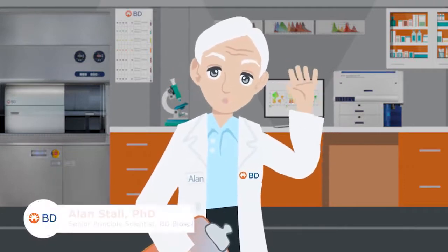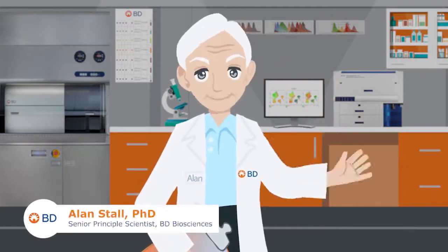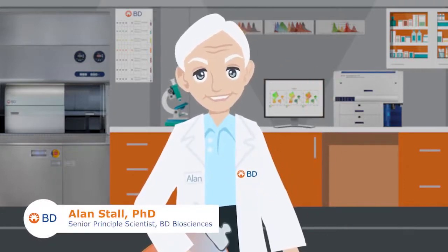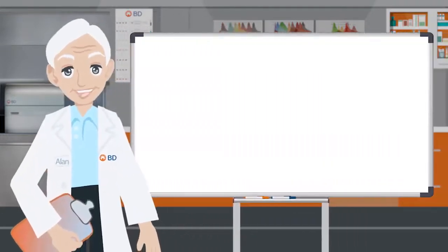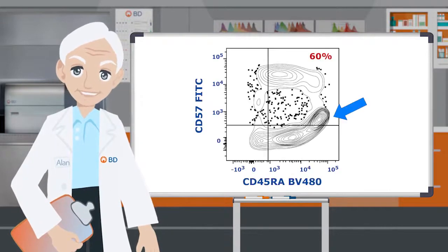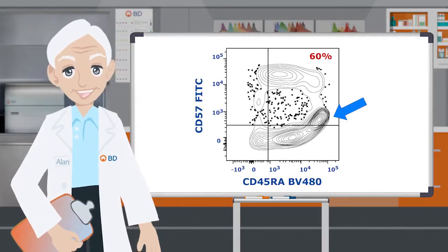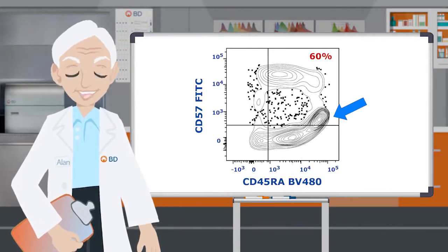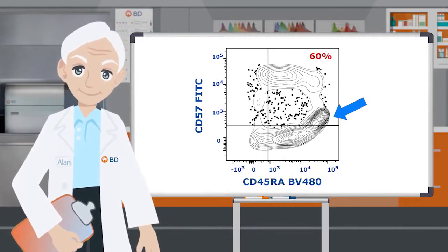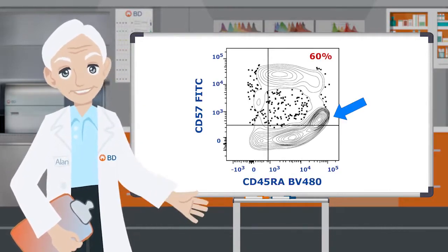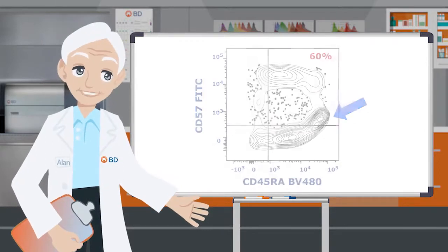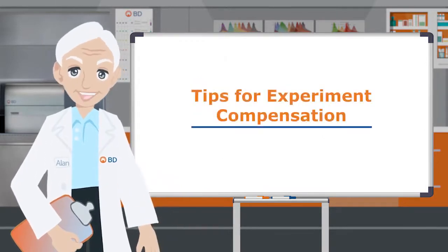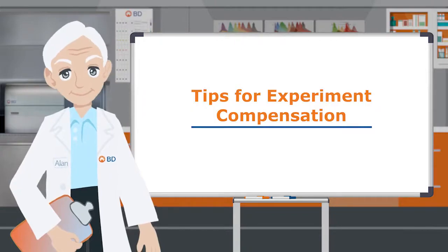Hi, I'm Alan Stahl, a Senior Principal Scientist here at BD Biosciences. Have you noticed that sometimes the compensation of your panel seems to be off? This is probably due to the controls that you used. Here are some tips to help you get the best compensation for your experiments.